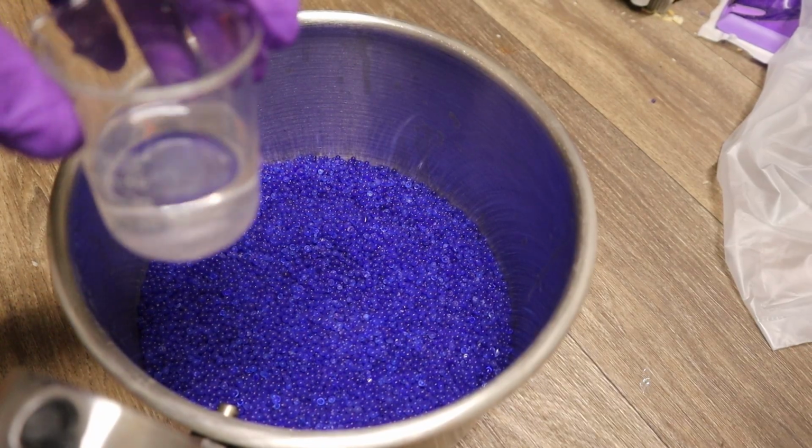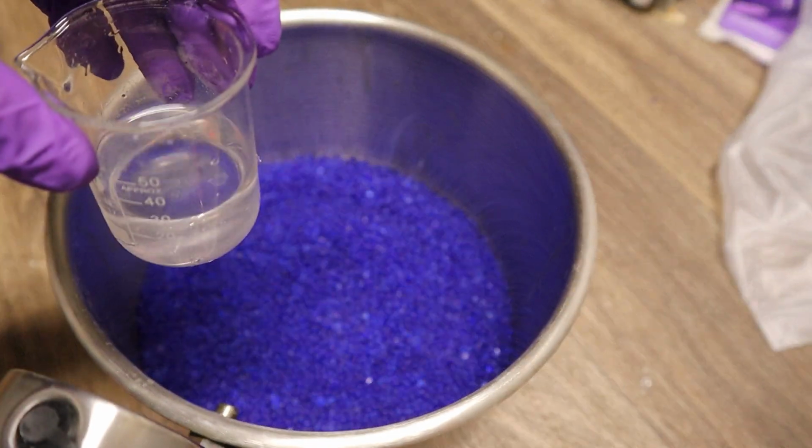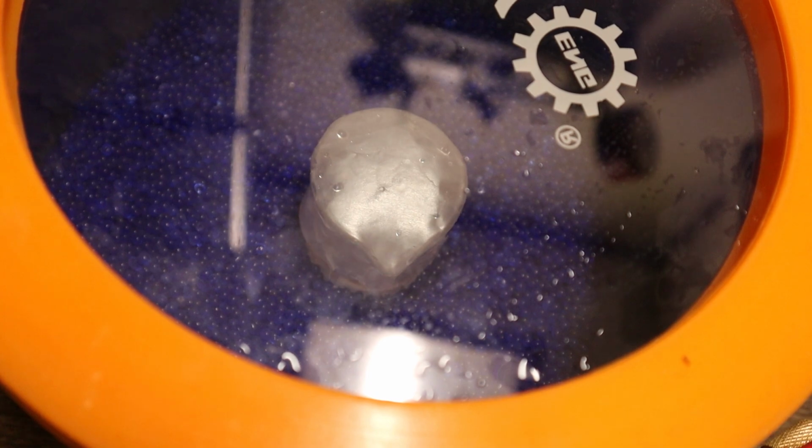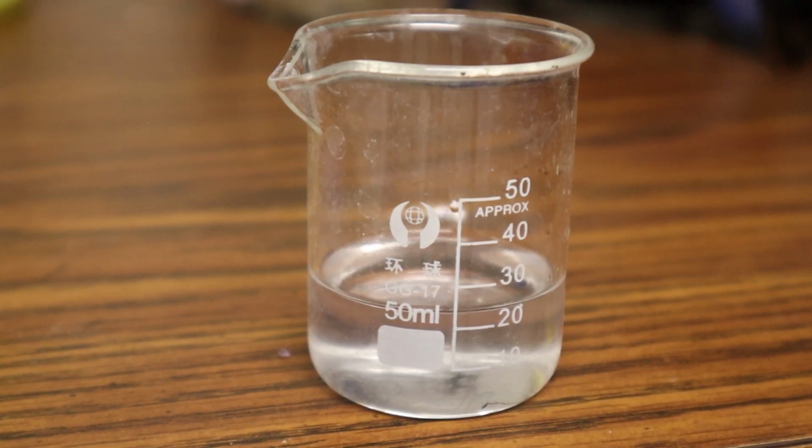But because of my impatience, I accidentally made it overboil and spill all over the lid of the container, losing around 25% of it. And I still didn't learn my lesson, and tried putting some parafilm on, hoping that would stop it from spilling out. But it just blasted right through that, taking me down to just 20 milliliters left. I then decided just to precipitate it as is, and not risk drying it anymore.